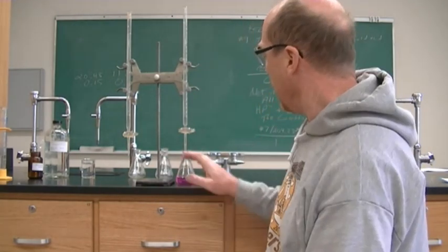All right, so that's something you always need to do to make sure that your deionized water is at a pH of 7. And it is. One drop turned it pink, and so our water is good to go. I will set up for the next titration.